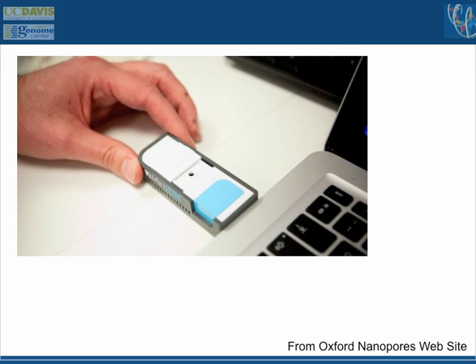All self-contained within this tiny thumb drive, which is ridiculous. It's not clear how well this works. It's not clear if the error rate goes up a lot when you attach something to a thumb drive system as opposed to a more controlled environment. But I really want it.